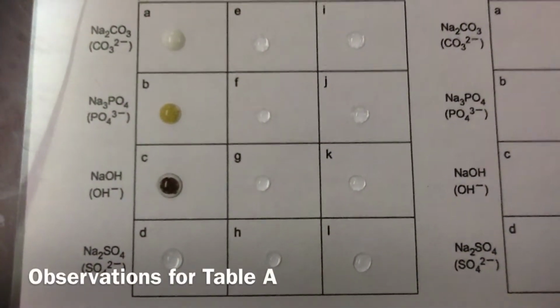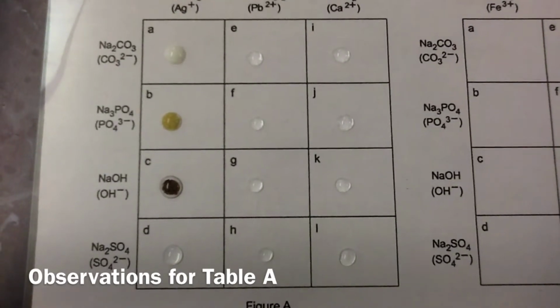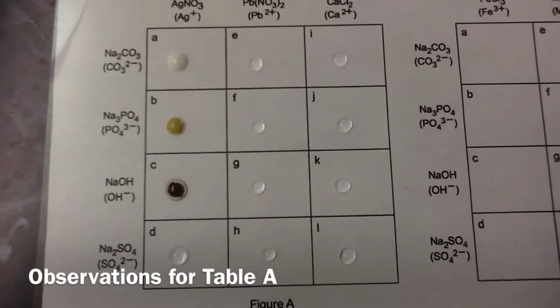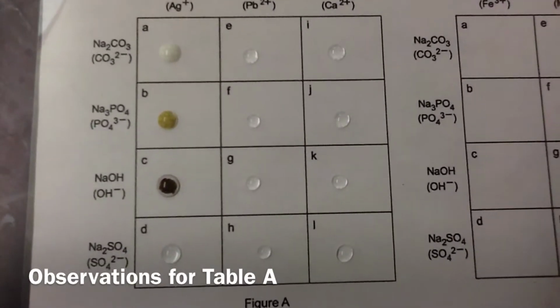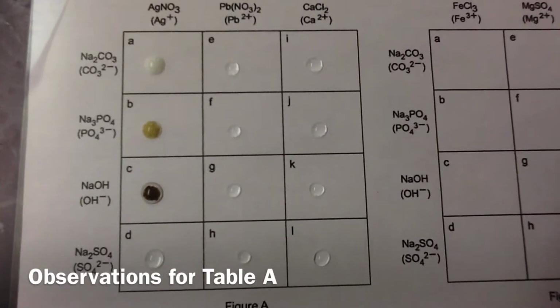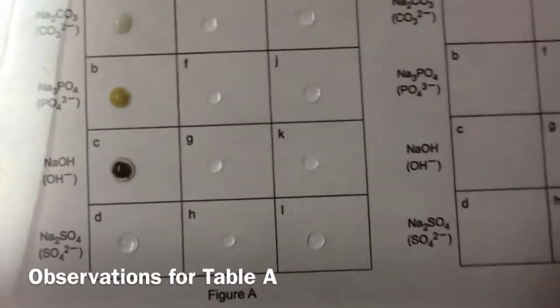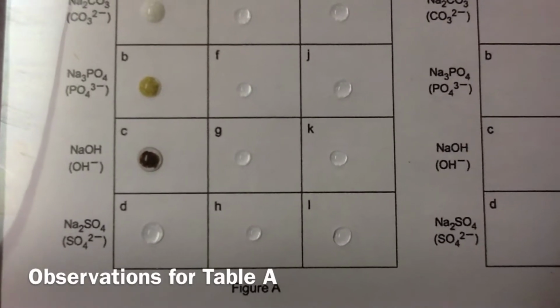So when we mixed AgNO3 and Na2CO3, we found that the color turned really milky immediately. And then when we mixed AgNO3 and Na3PO4, it turned yellowish, kind of mustard colored. And then AgNO3 and NaOH turned brown or blackish, with a little clear around the edges of the bubble, like a brown olive. And then AgNO3 and Na2SO4 remained clear.